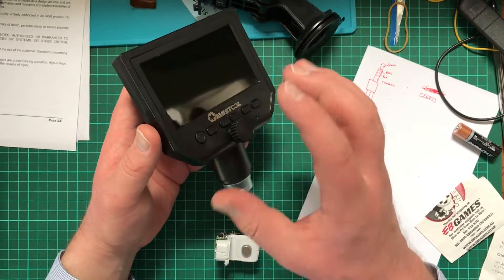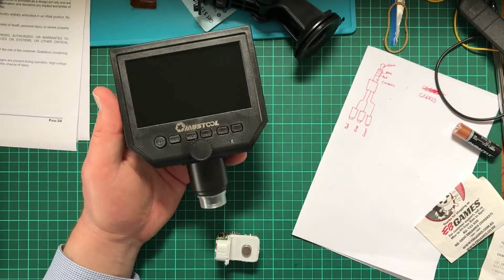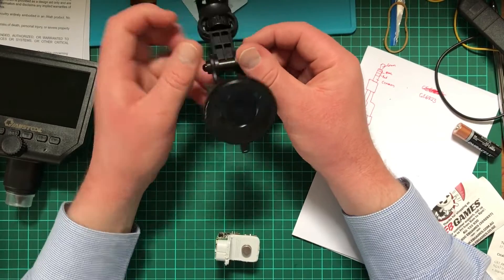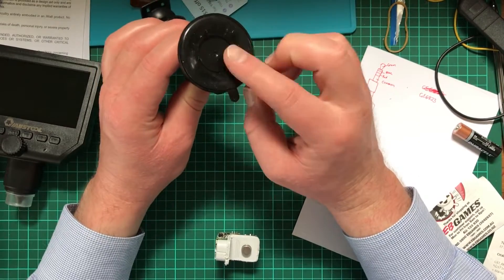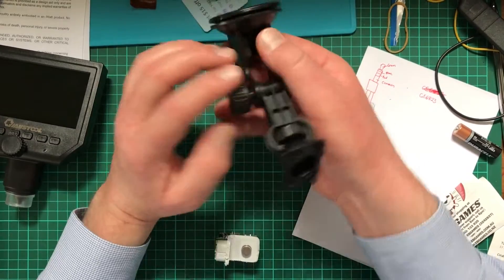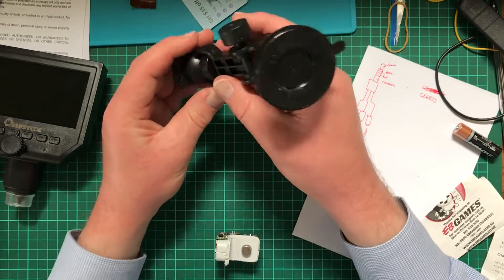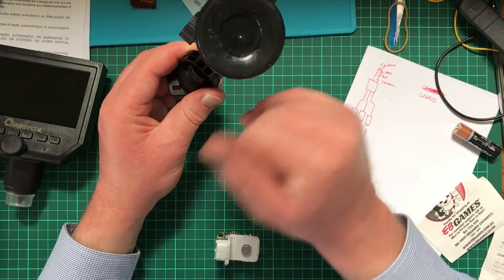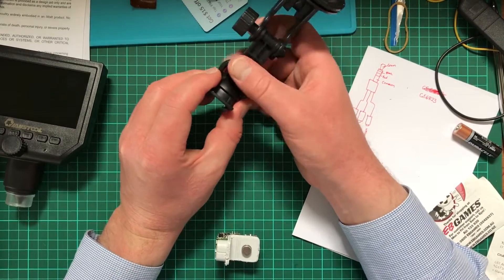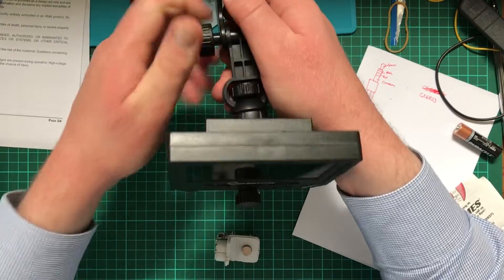This knob does feel very weak, and I'd recommend against trying to pick the whole thing up by it. As for the stand that came with it, the bottom part here is actually quite adhesive — that's the reason you're supposed to stick it onto a surface. A couple of times I did have the nut in here fall out, and it is a little tricky to get it put back in place. A few ways you can mount it: stick it like this on your workbench.